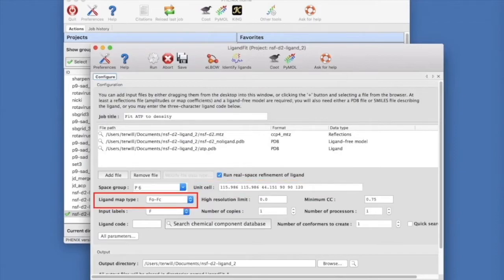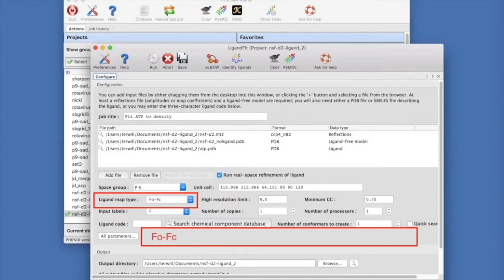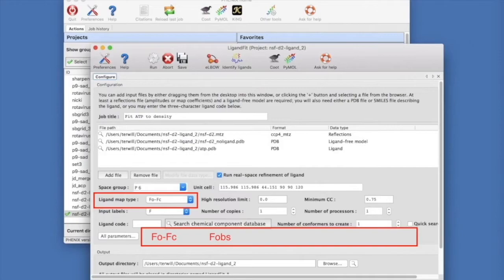Choose the Ligand Map type. Your choices are FO minus FC, which is an FOBS minus FC map phased with the model; FOBS, which is an FOBS map also phased with the model; and Pre-Calculated, which will use map coefficients that you input.